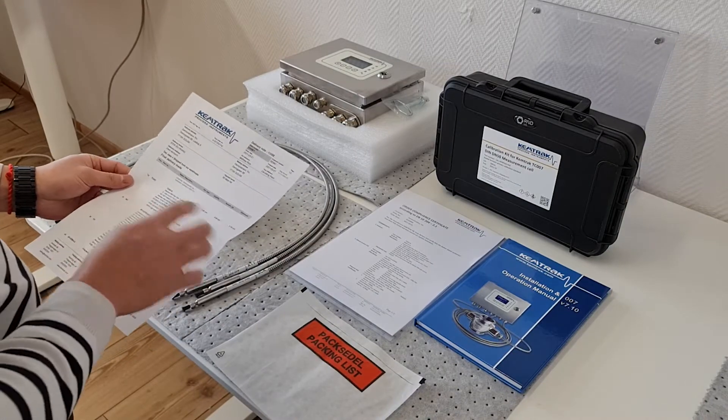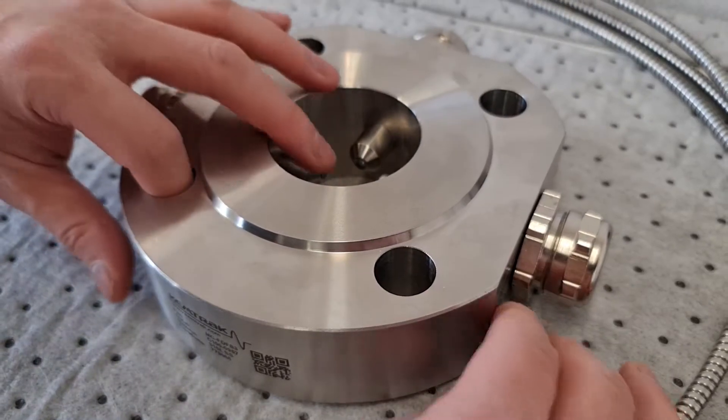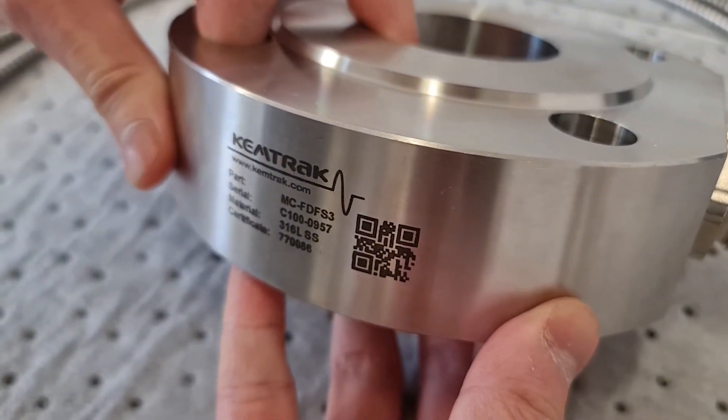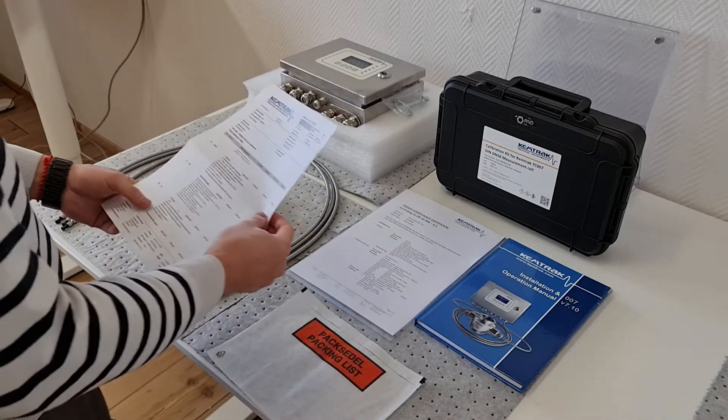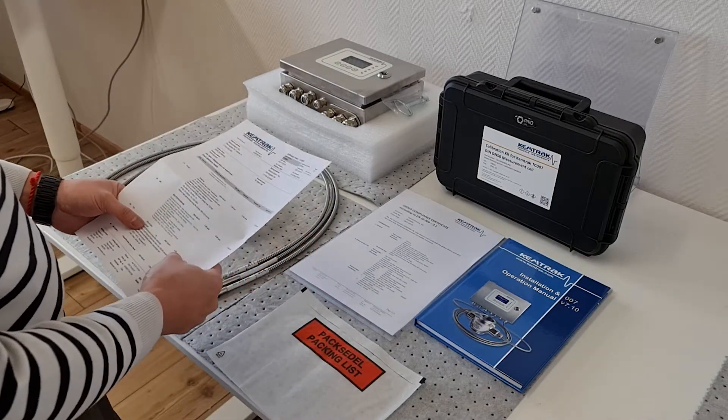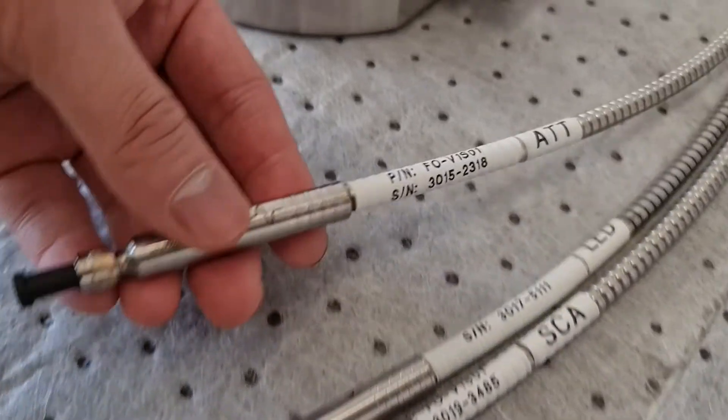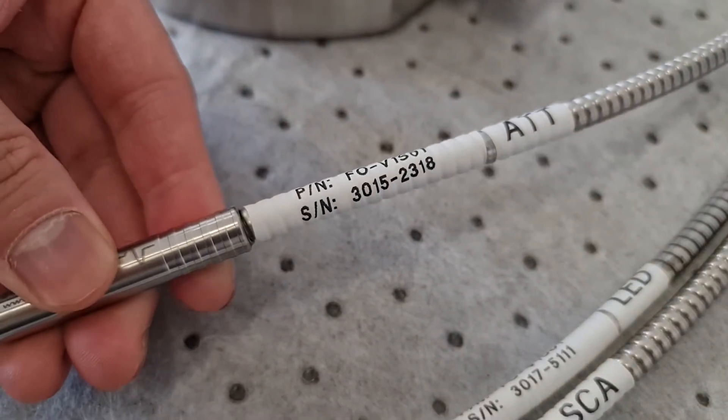The second item to confirm is the measurement cell. The part number of the measurement cell is etched on the front of the product. The third item to confirm are the fiber optic cables that link the analyzer to the measurement cell. Be sure to check the length and quantity of fibers received and match what has been ordered.